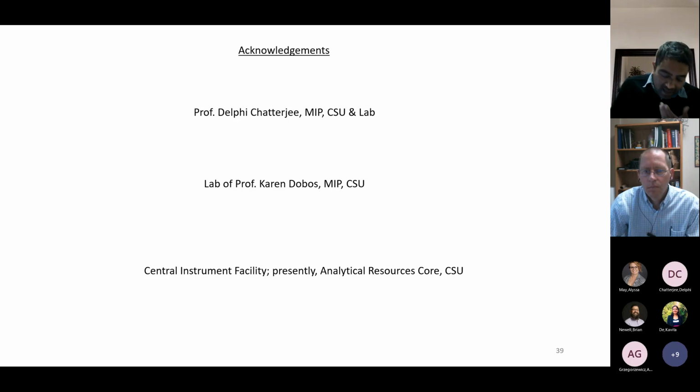You have seen the example I have shown for GCMS: the molecules have to be compatible. So all the hydroxy groups have to be protected or blocked with acetyl groups or trifluoroacetyl groups. But in ion mobility, you may not need those. You can go with the bare sugars as they are. If they vary in stereoisomeric features, which considerably changes the structure, you will be able to resolve it.